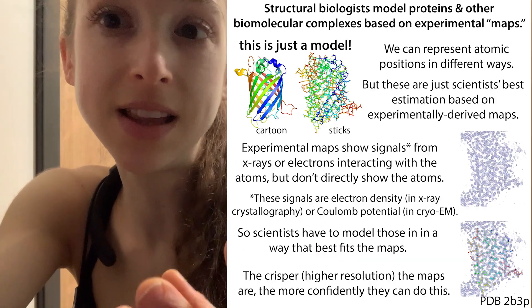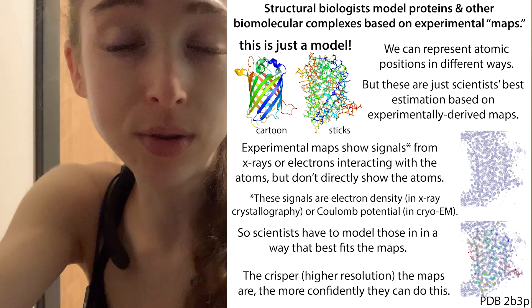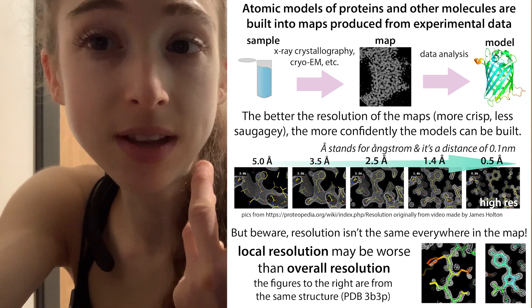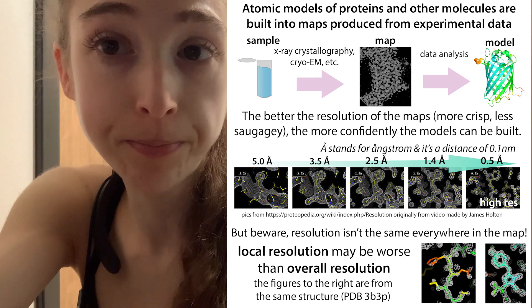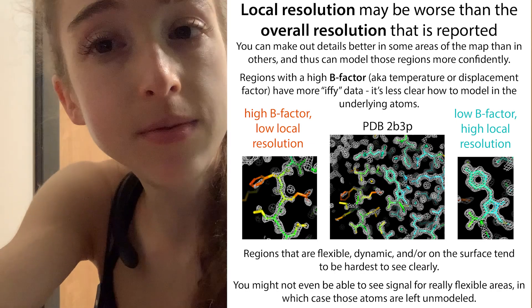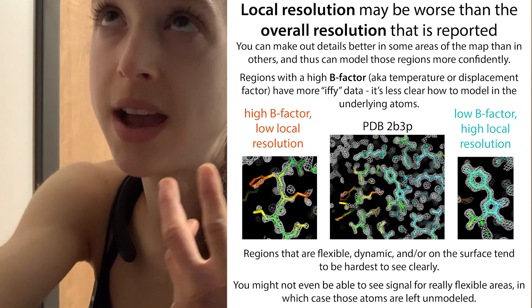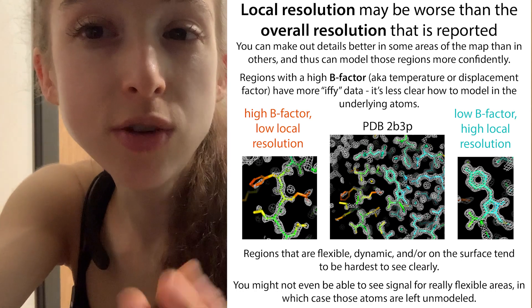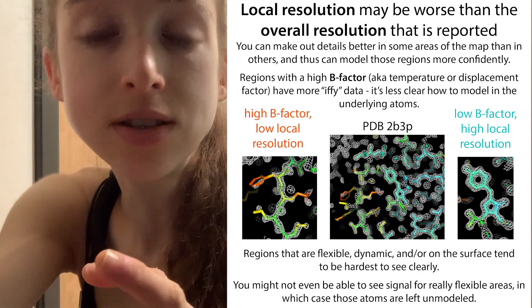At 1.5 angstroms we're talking about atomic resolution, but you can't just directly read off atoms from the map — structural biologists actually have to build the model into it. They also have to contend with the fact that the reported resolution is typically the overall resolution, but flexible regions of a protein may have lower local resolution. So when reading a paper, you should ask: is the resolution at the specific site you care about actually strong enough to model accurately? Does the data really support their claims about that exact area?